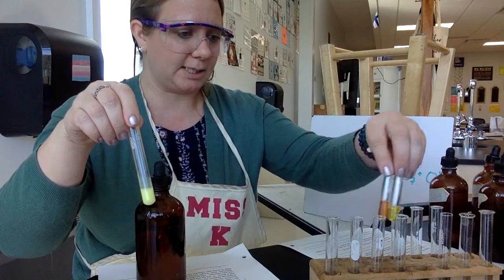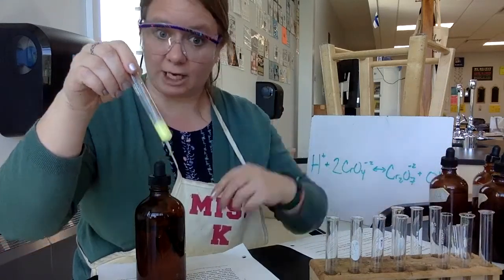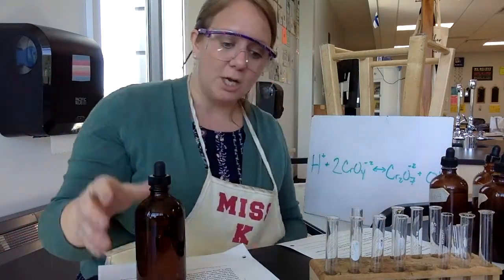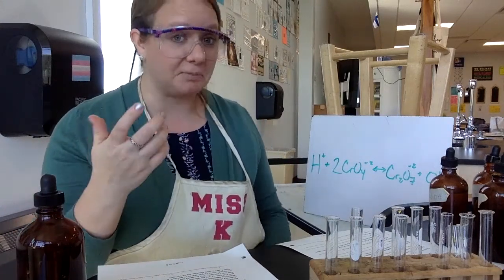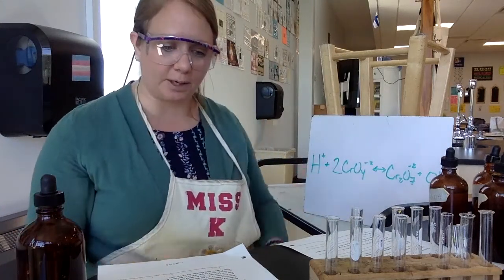All right, I'm going to adjust some of my test tubes here because I've got to use this one again later. So that was step 6. We created a precipitate when we added a new ion. Something interesting is going on with this equilibrium, right?